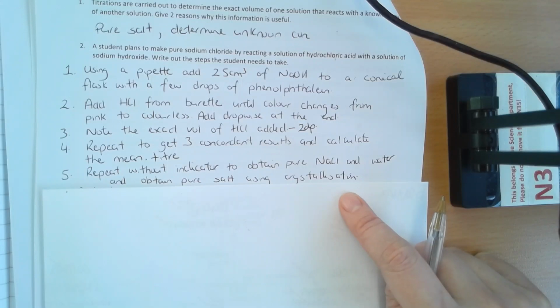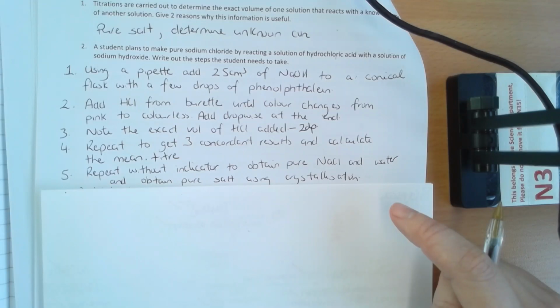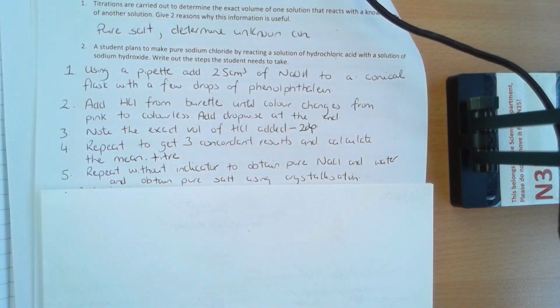Okay, you do need to write this. They've asked it before as a 6 marker, and you're going to see it when we look at fertilizers, actually, because we're going to use titrations again when we look at fertilizers, and that's when they asked it. So just make sure you can describe this process in relevant detail.